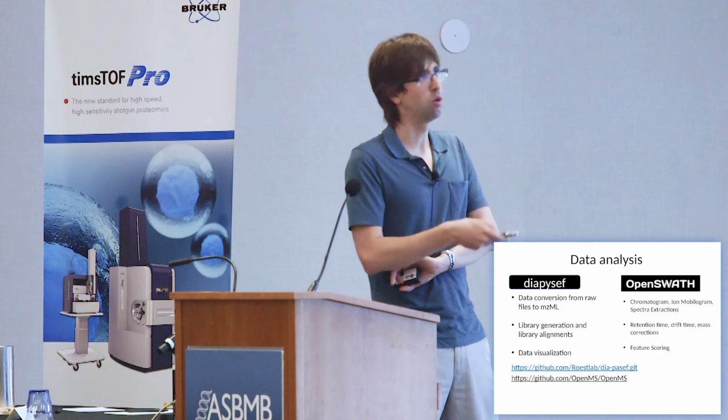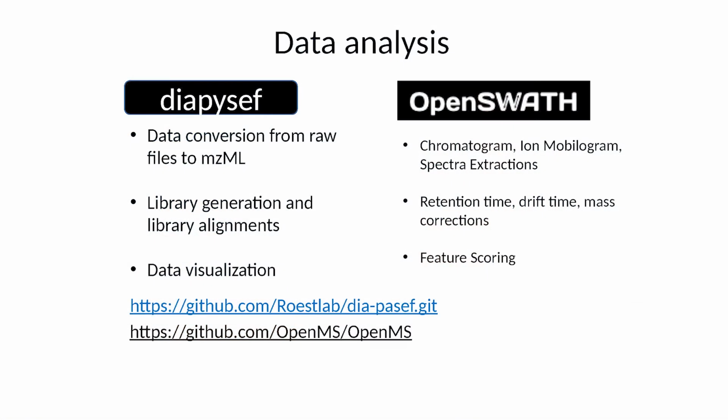Secondly, we are using OpenSWATH as part of our pipeline that is consuming these libraries and raw files that are generated by diaPASEF, and we perform extractions and scoring in a very similar manner as we have done with traditional SWATH data.